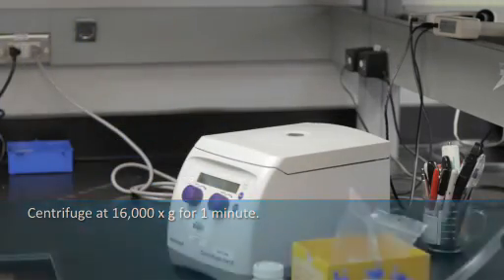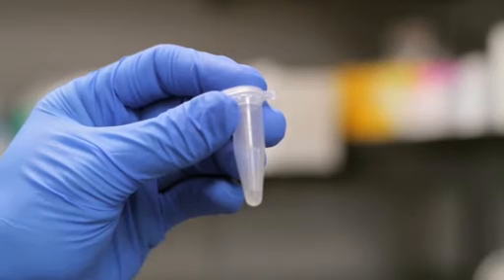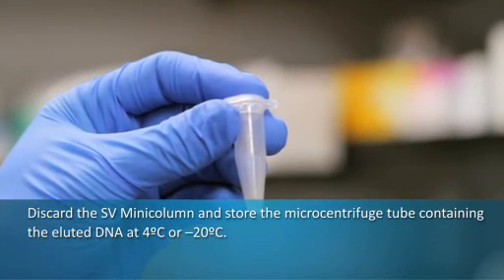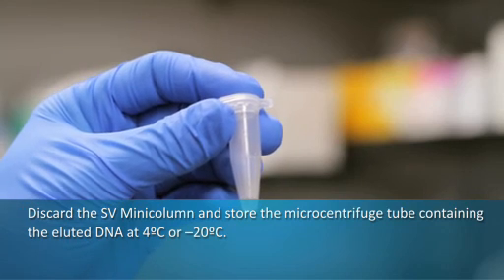Discard the SV mini column and store the microcentrifuge tube containing the eluted DNA at 4 degrees Celsius or minus 20 degrees Celsius.